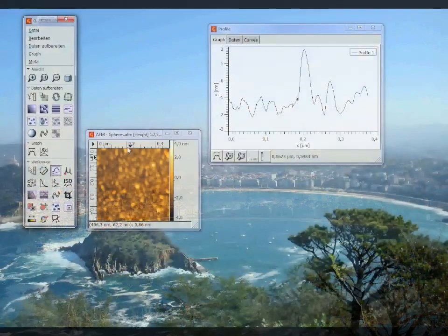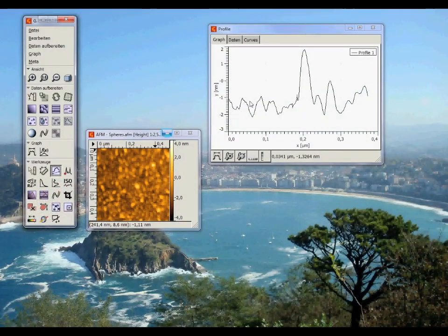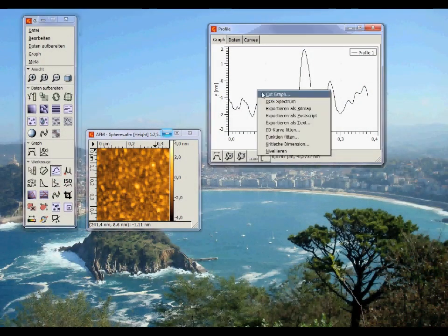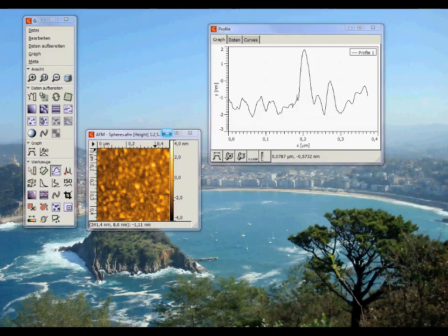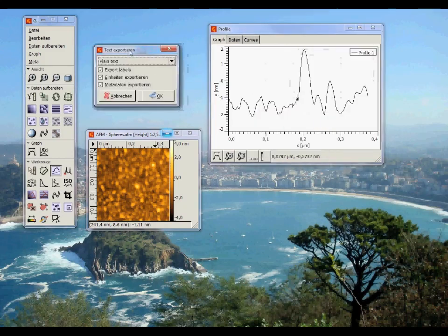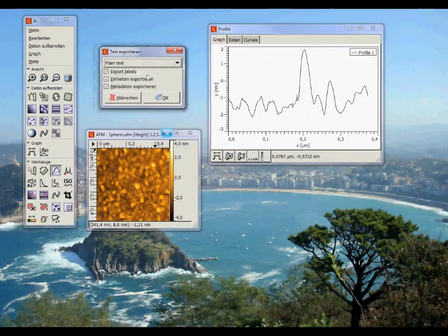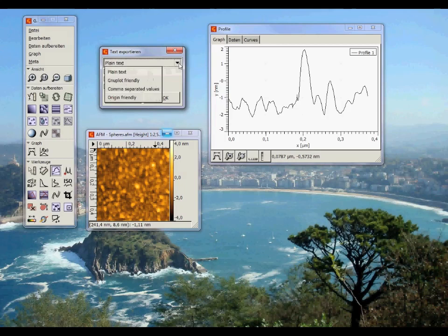Next step we export the real data points. Right click on the extracted profile and select save as text. Now you can specify some export formats.